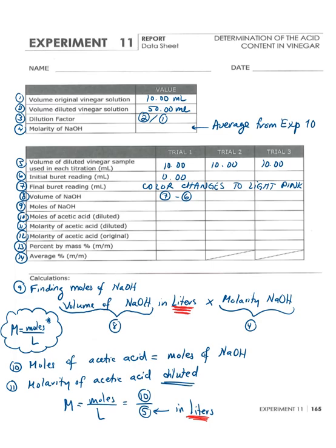Initial burette reading, that's going to depend on your titrations. The first one, you're filling the burette all the way to 0, but you're using some of that volume for your first titration. So for the initial volume for the second one, you need to check what's the volume of sodium hydroxide you have left in your burette and copy that number.